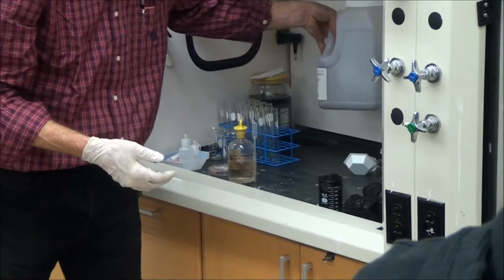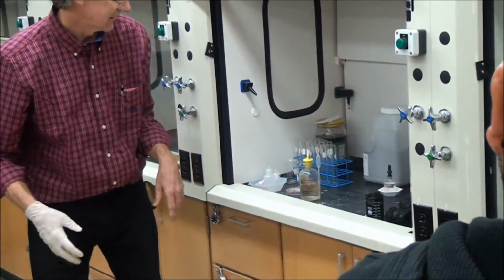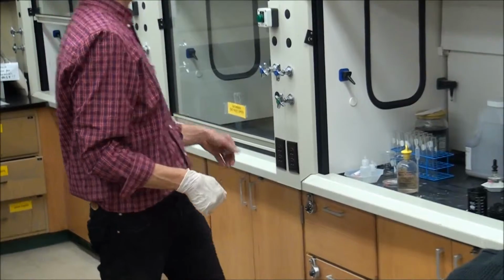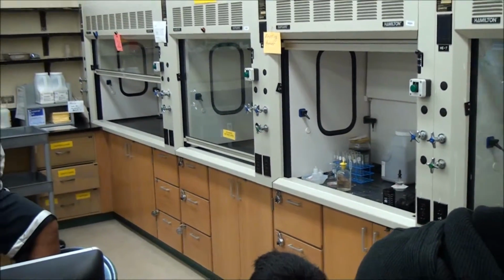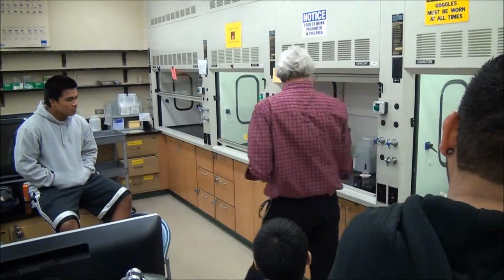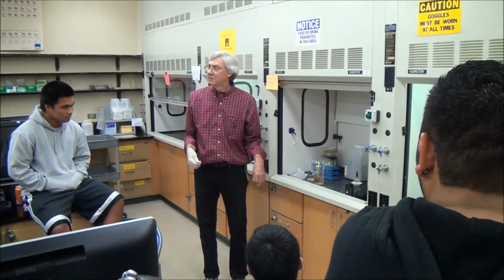So you're not going to want to touch that with your hands. And it stinks like the dickens. We can turn on the hood. What's happened?